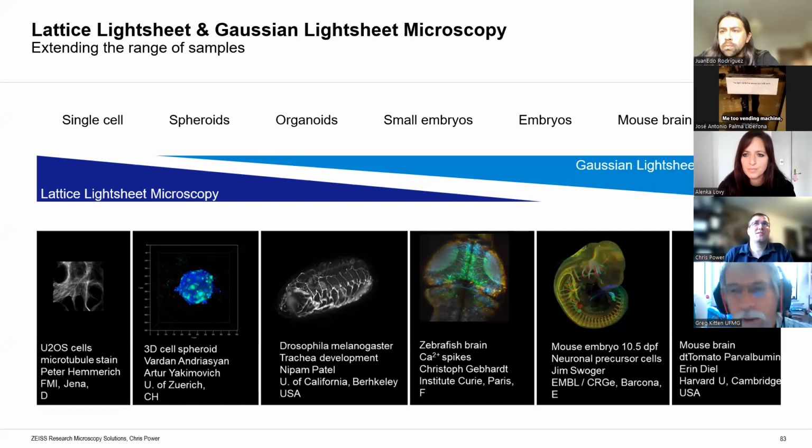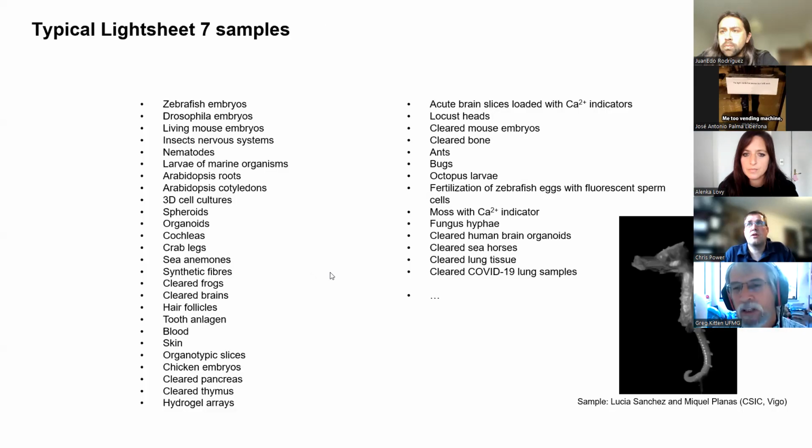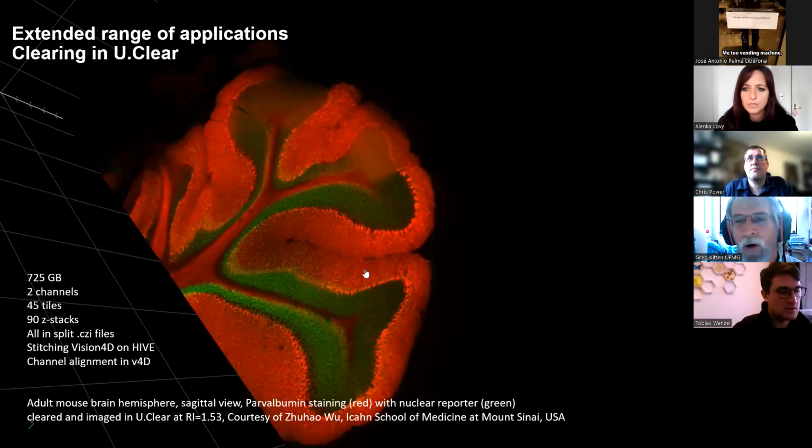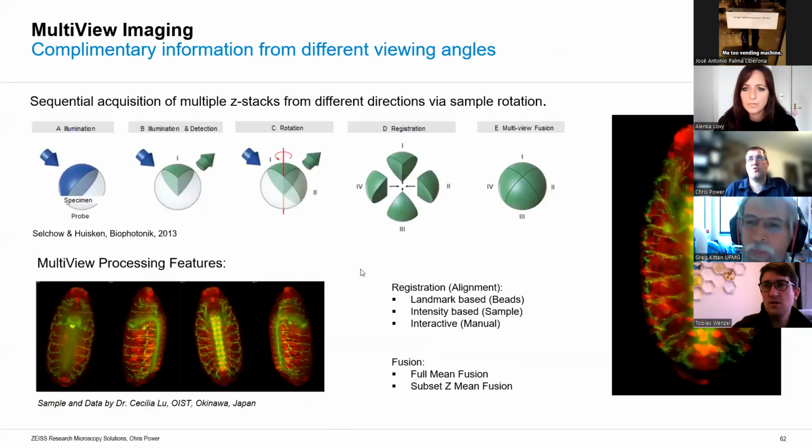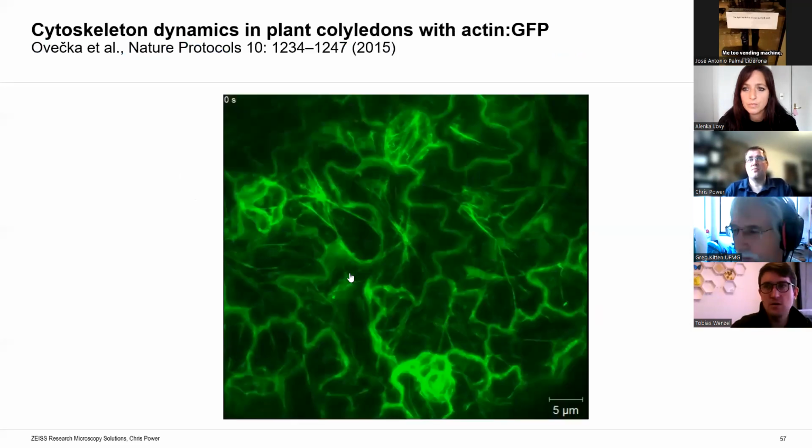Yes, ask away. You had various holders here. Usually the holders, I presume, are somewhat expensive. So if you have a system, do you select 2 or 3 different holders separately, or how does that work? Okay, there are 2 or 3 different things when it comes to holders.